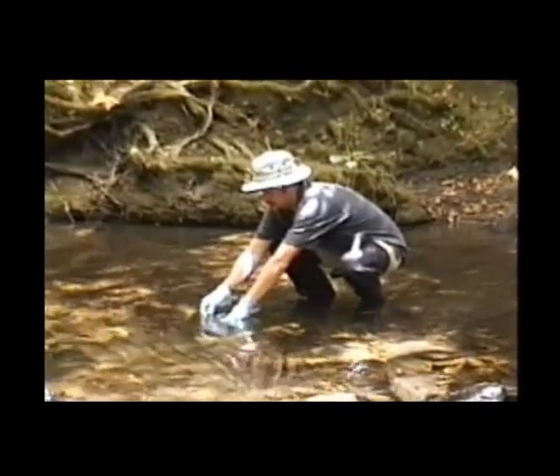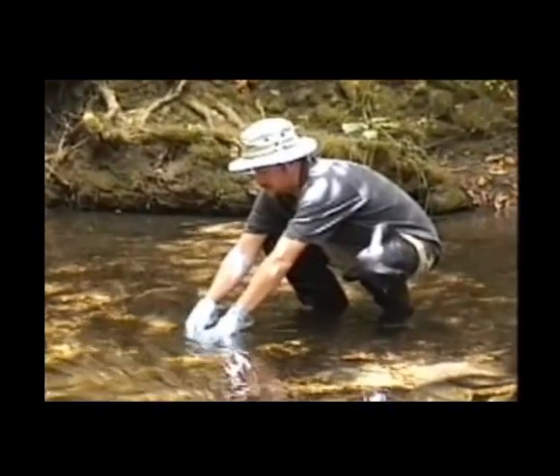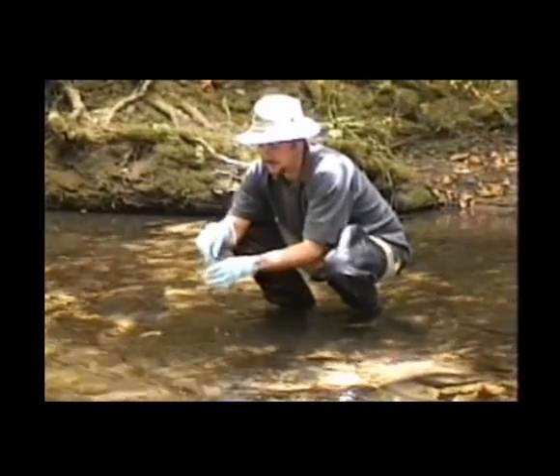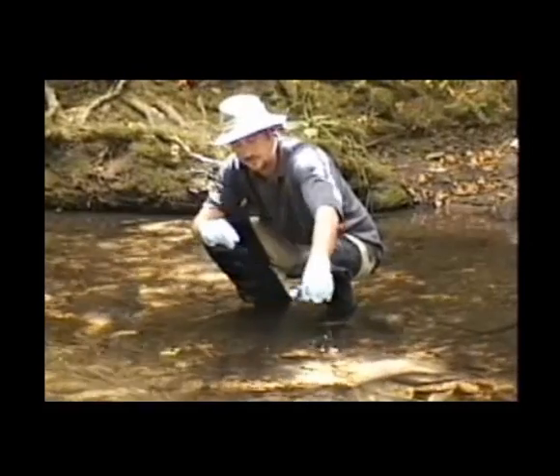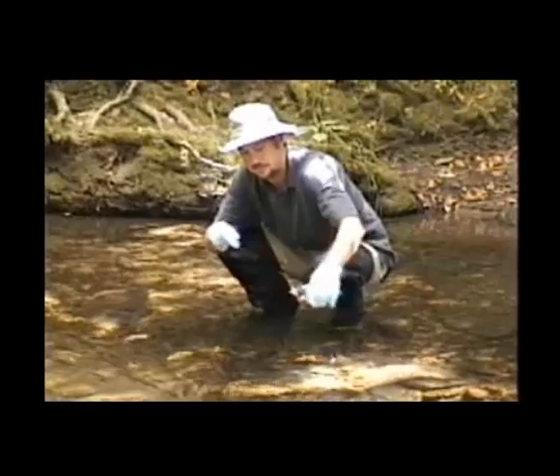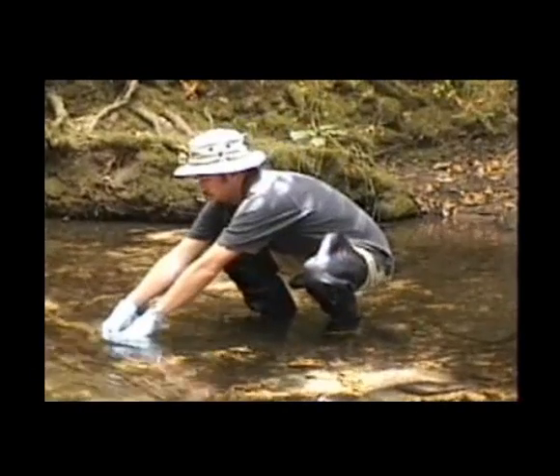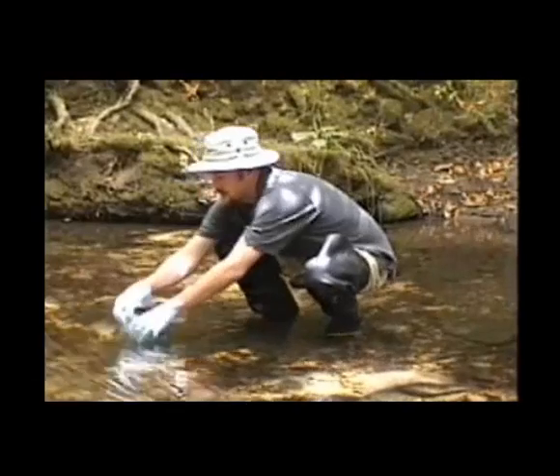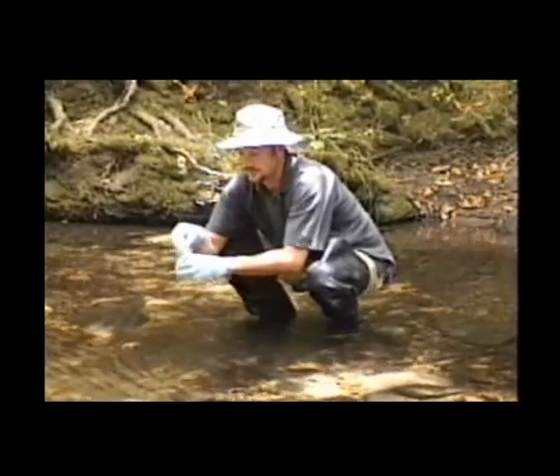The sample is opened under the surface of the water and then rinsed 3 times with ambient water. Here, clean hands performs the first rinse, empties the rinsate downstream, caps the container, opens the container underwater, and washes both the cap and the container very carefully.